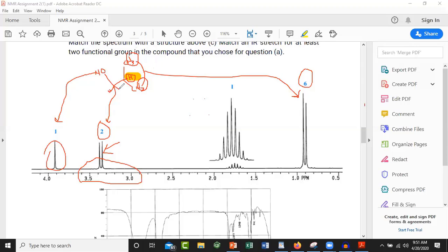So it actually has 8 neighbors, right? So the N + 1 for that should be what, 9? Yes. So N, that's not an H, +1 is 9. I feel like a kindergartner using this mouse pad, right? So let's count them up. That's 1, 2, 3, 4, 5, 6, 7, 8, 9. Following?